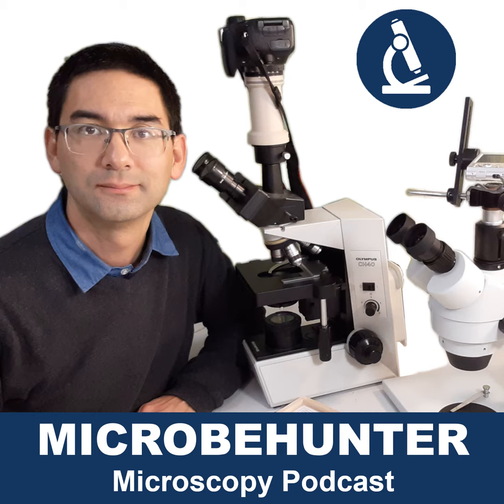The second reason why you should start with a low power objective is because it generally has the highest depth of field, so focusing is significantly easier, and you can also use the coarse focus knob to quickly find the focus. So generally, if a high power objective is in position, then always rotate it to the 4 times low power objective, because ultimately you're going to be much faster than trying to find the focus using the high power directly. So I think this was enough for problem number 10.